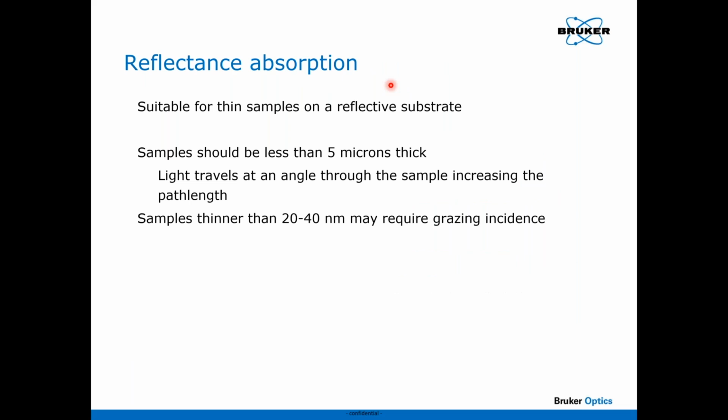well. So reflection absorption, some people call it transflection, is another really good example. You have a reflected background, and then you shine the light through the sample and bounce off the backing, and then look to see how the signal works. Now, you remember we talked about the sample having to be optically thin. Now the samples have to be twice as thin because you're going to bounce through twice. If the samples are very thin, you might have to do them at grazing incidence. But the Lumos is sensitive enough that if it's thicker than about 20 nanometers, you can do the job with the Lumos.